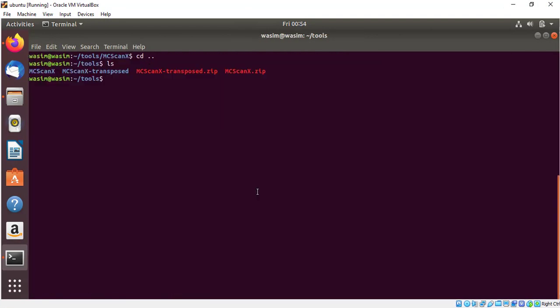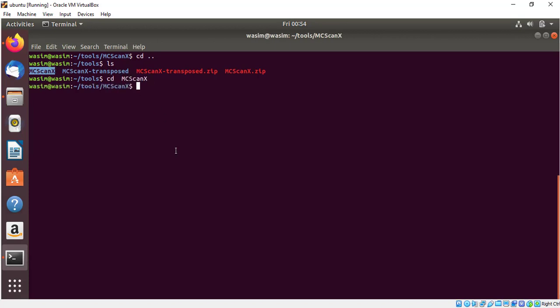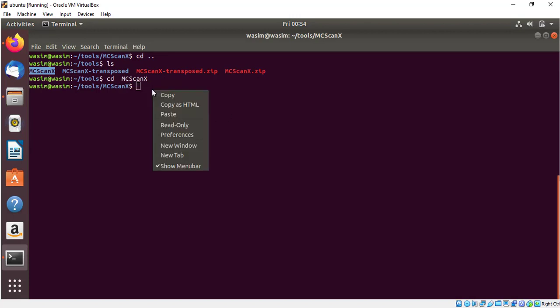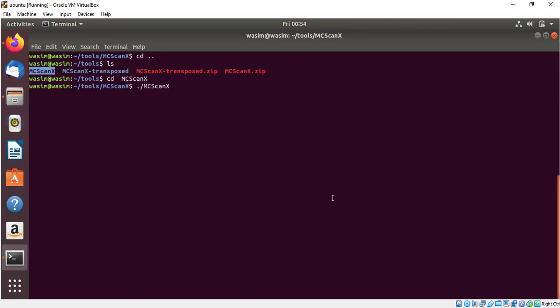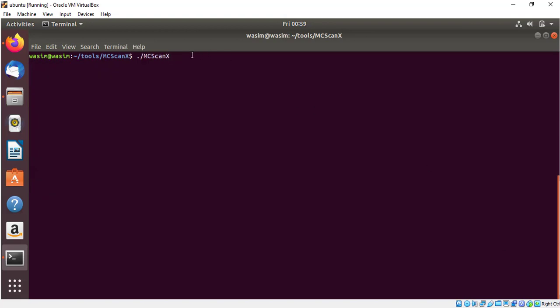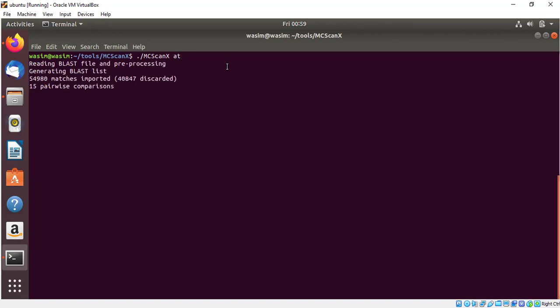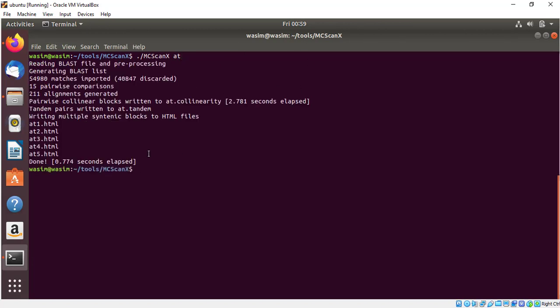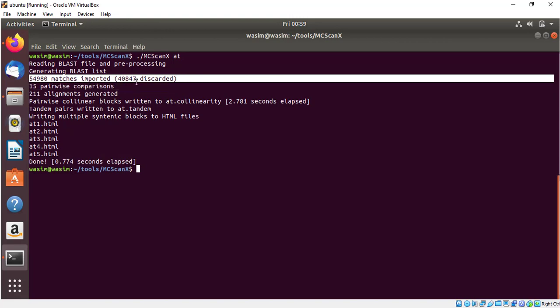Both of our programs are now successfully installed to check whether it's working or not. First of all we will go to MCSCANX folder. Here we will run the command dot slash MCSCANX and then press enter. If the window like this will appear, it means our program has been successfully installed. Type dot slash MCSCANX and the name of your data. I name my data to add for analysis and then press enter. This will process the files and you will get the result. It will contain some bundle of files showing 54,980 matches are imported, some are discarded, 15 pairwise comparisons, 211 alignments were generated and some other information.